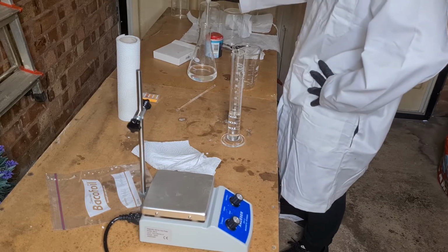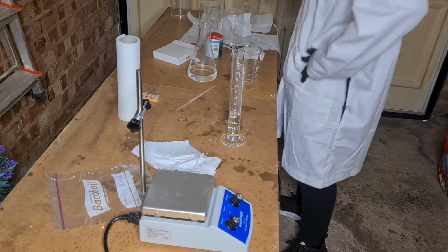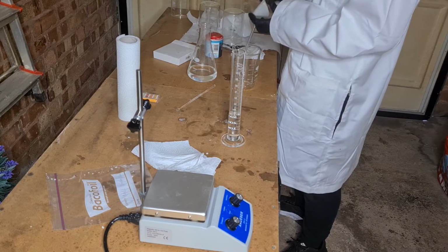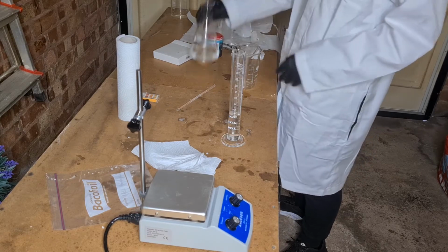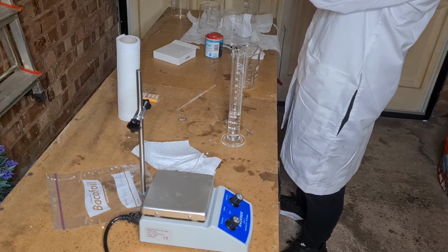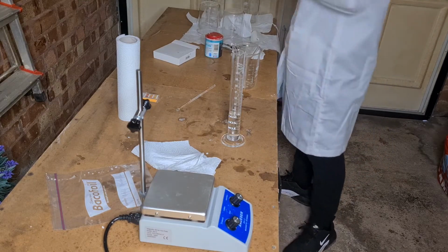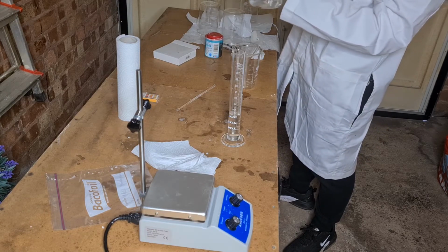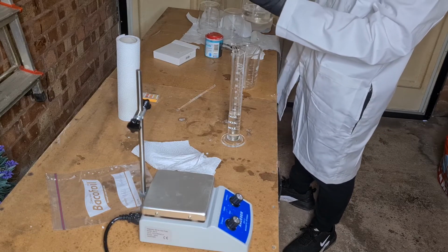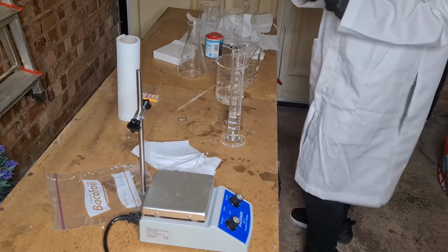Now that's done filtering. We can take that out. We can actually just stick this in our beaker. Take the filter paper out. We don't need that anymore. And now I have this nice, hopefully clear solution, which it is. So now we're just going to use this beaker. We're going to pour it into here. And this is the fun part, where the reaction actually happens.